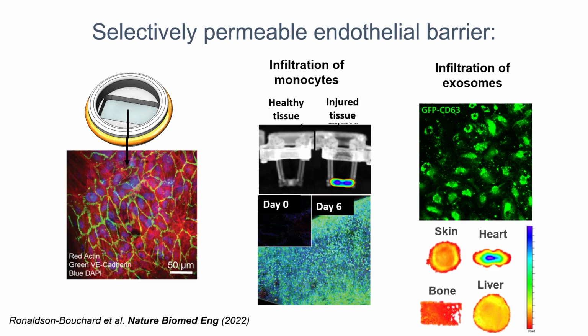It's very interesting that we form endothelium by coating very porous and elastic membrane by endothelial cells. We let them attach. We add supporting mesenchymal cells or pericytes. They need some support. And then we condition this endothelium to become confluent and quiescent by ramping up the shear. This is like a known protocol in the field.